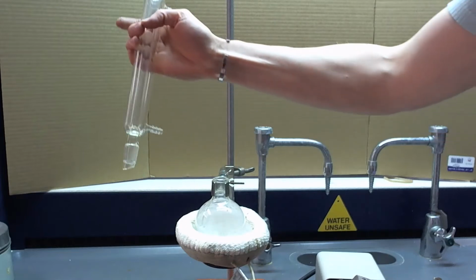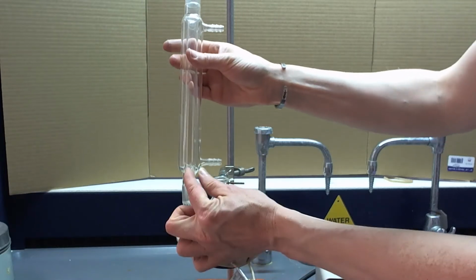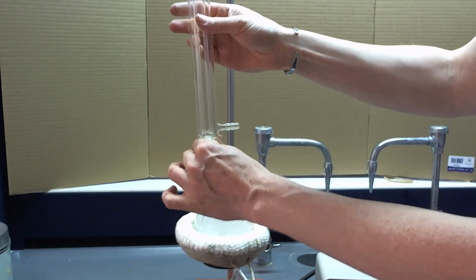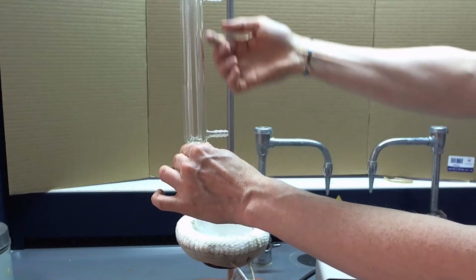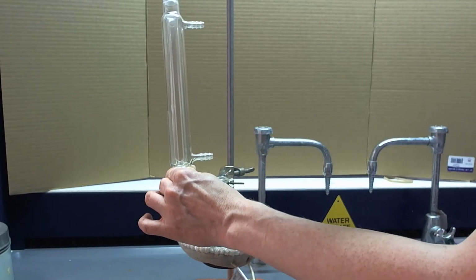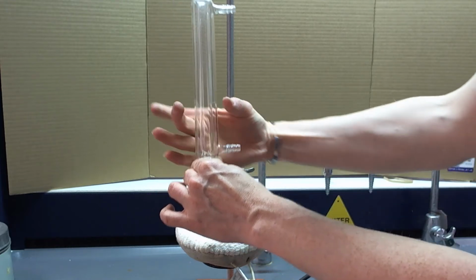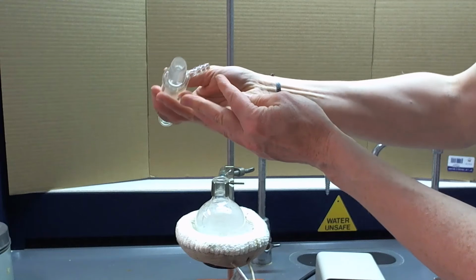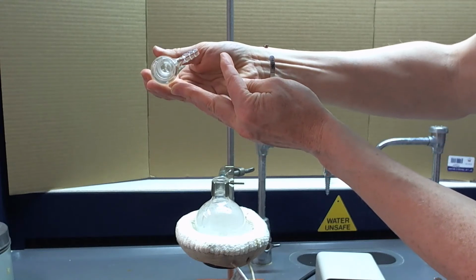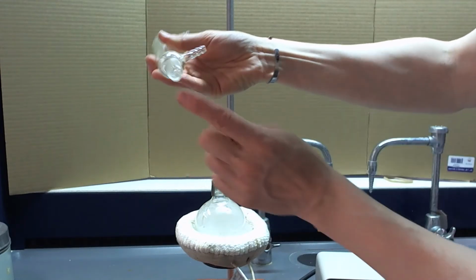So the reflux condenser has a tube in the inside that's jacketed by this outside part with the two ports, okay? So this outside is a layer that jackets the inner tube that, if you look at it head on, is hollow and open, okay?